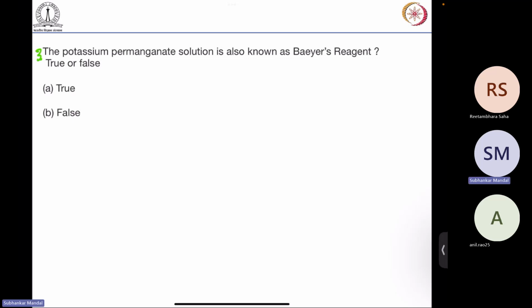I think the Professor has discussed many conditions, such as things present in the system like thiosulfate, stannous reagent, or zinc oxide, which is a basic oxide. If those are there, then there can be errors in the data. Okay, so now we can concentrate on these problems.